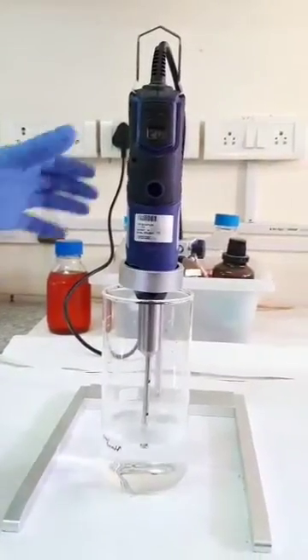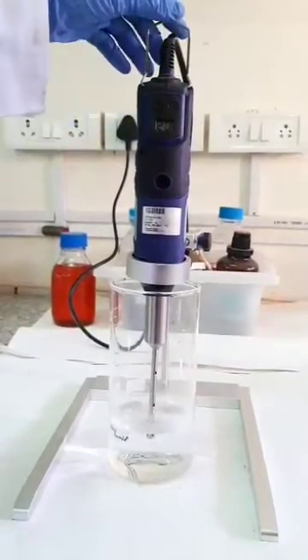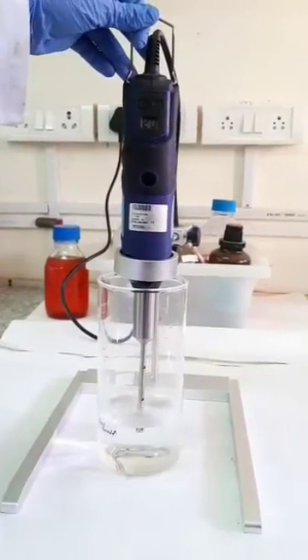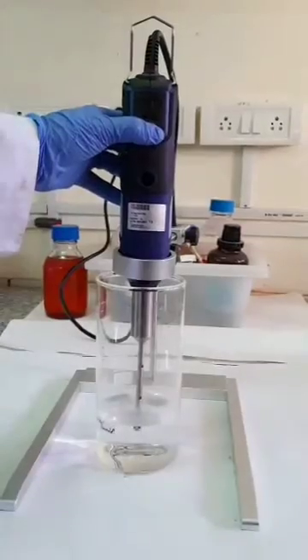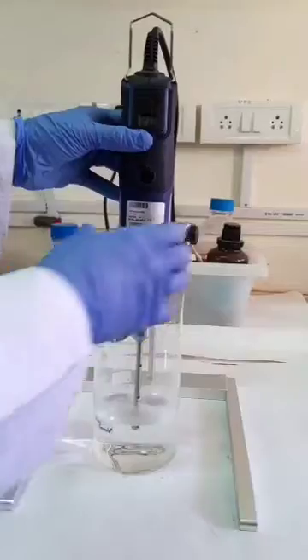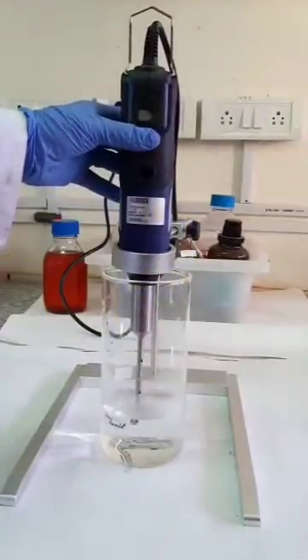After 50 minutes of continuous stirring, I am taking 1 mL of my final formulation and diluting it 1000 times in milli-Q water, which is double distilled water.